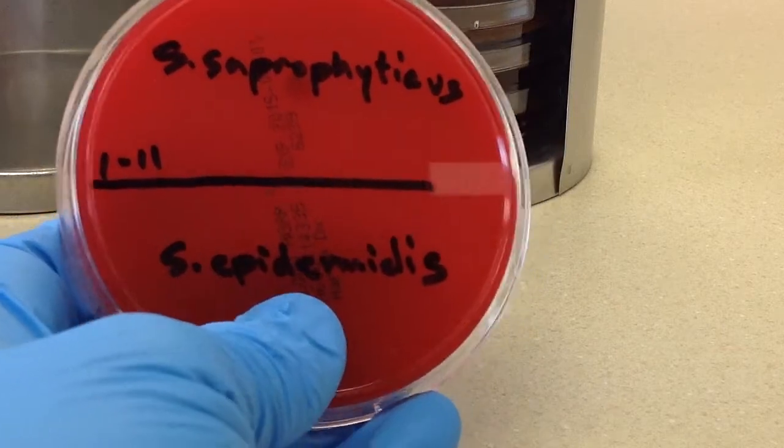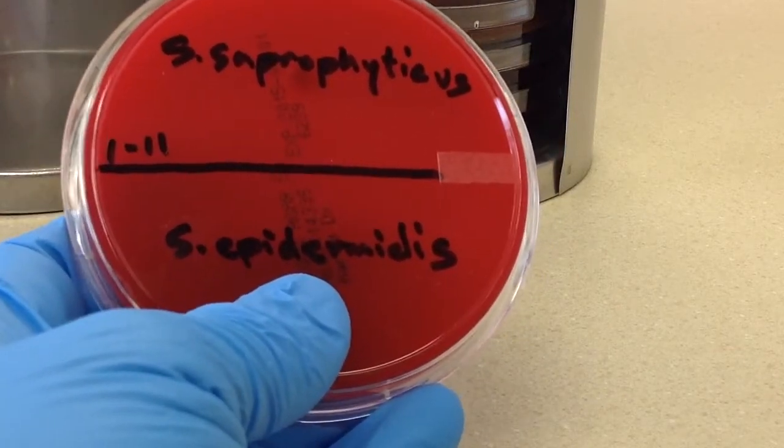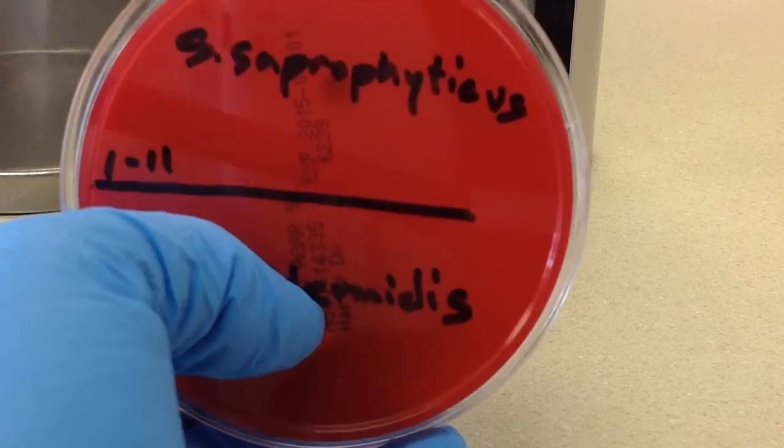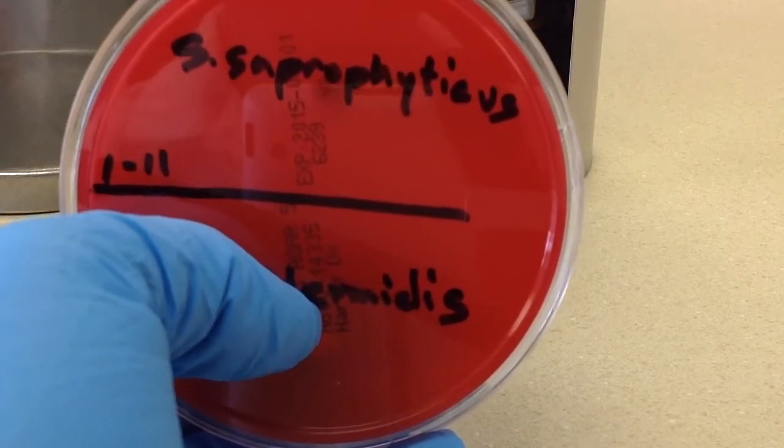Now this plate is ready to go. I'm going to go ahead and incubate it at 37 degrees for basically 24 hours.